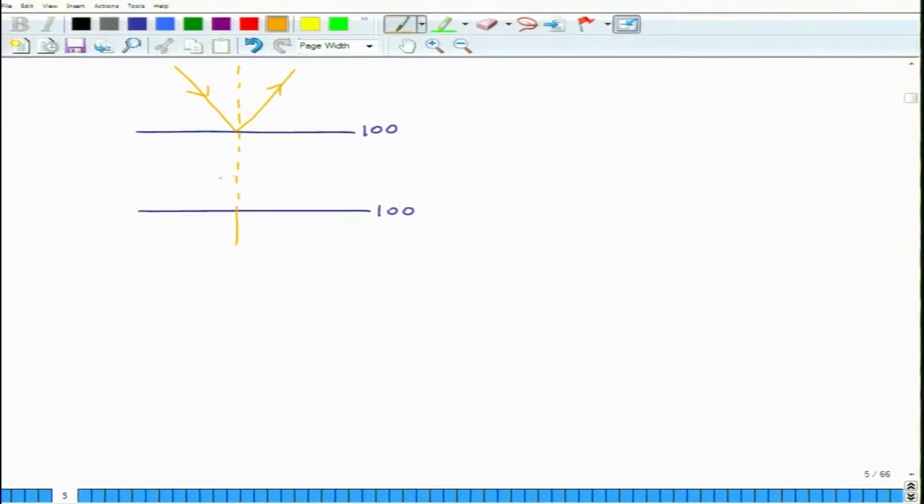And this is, let us say, the other beam that is coming parallel to this. This is, let us say, the other one which is going parallel to it. This is the path difference. The path difference is this and that. If this was lambda, okay, then the path difference is lambda, okay, 2 lambda. All right. So, this is 2 lambda.